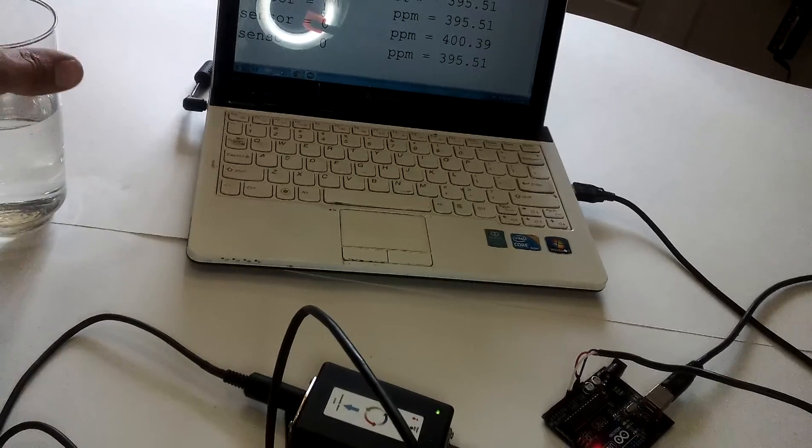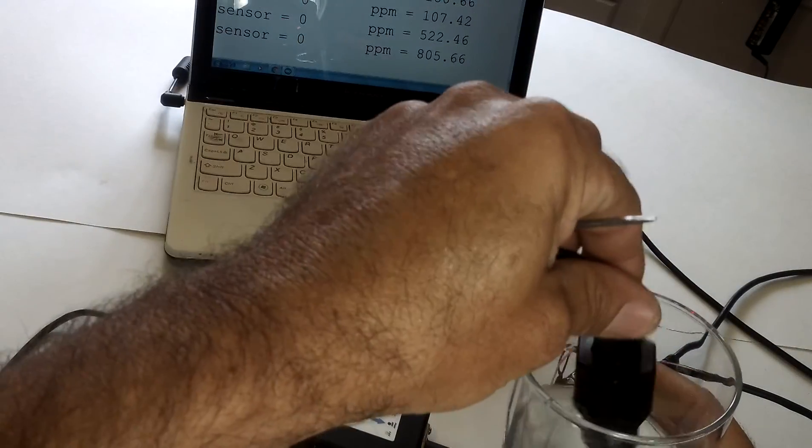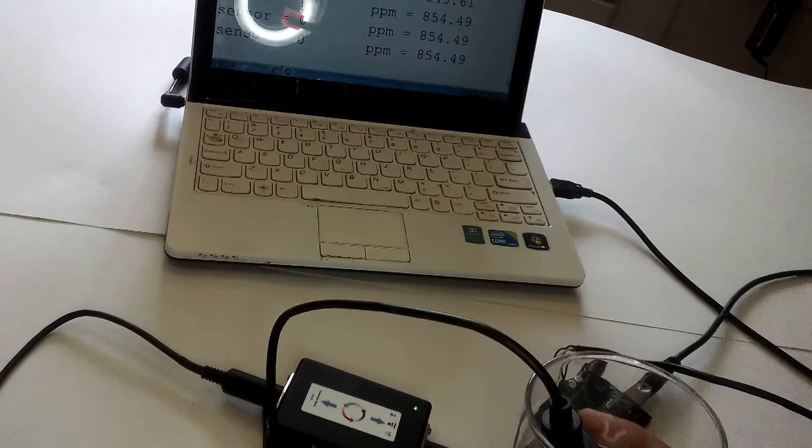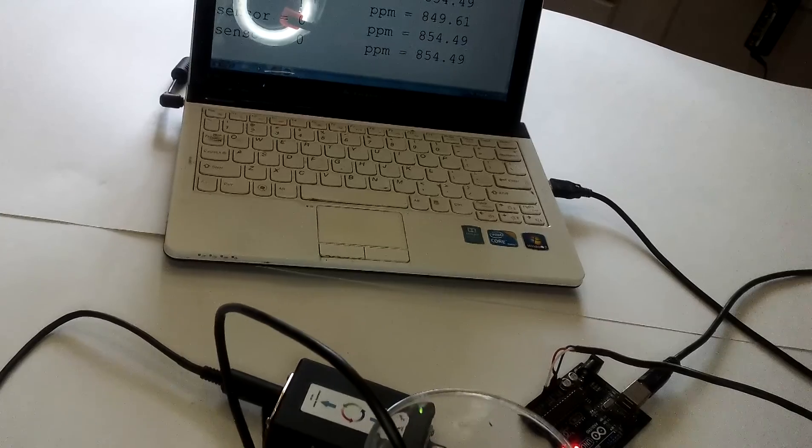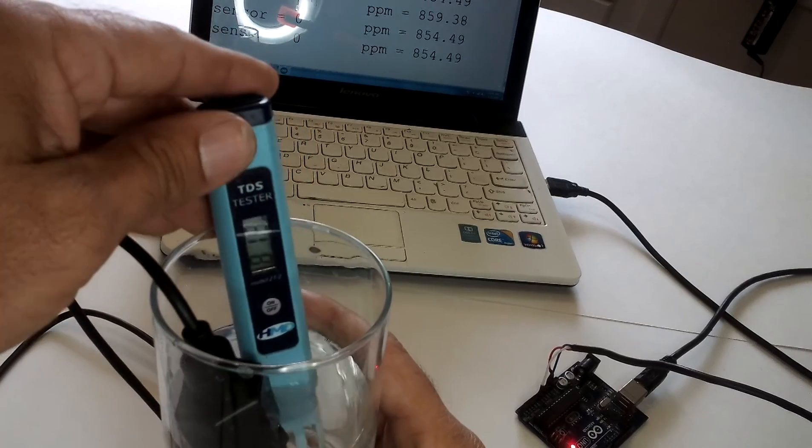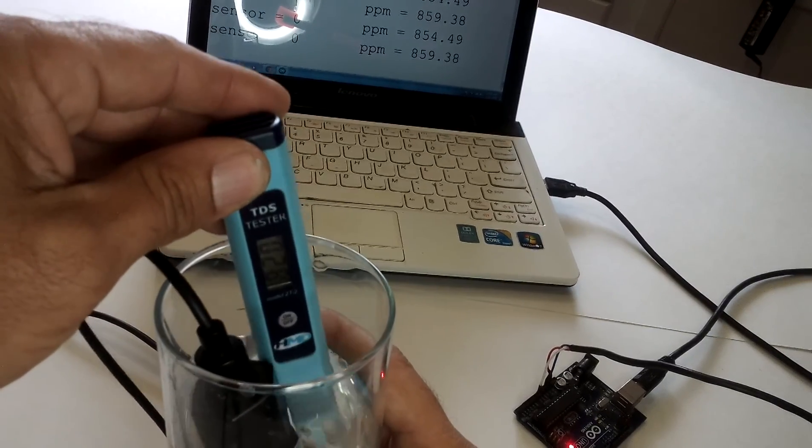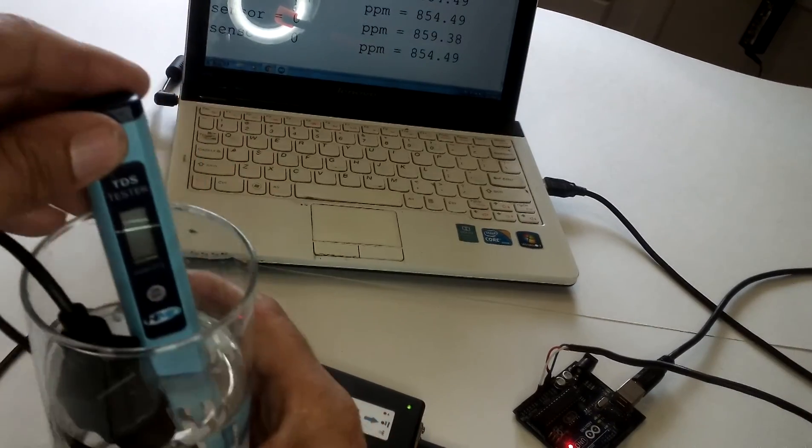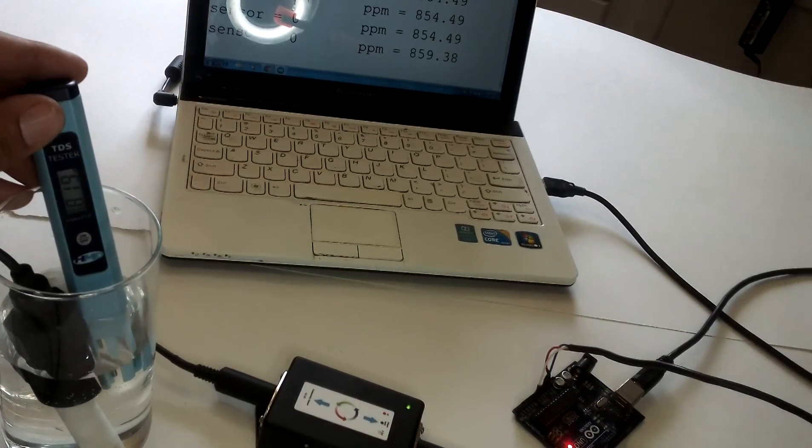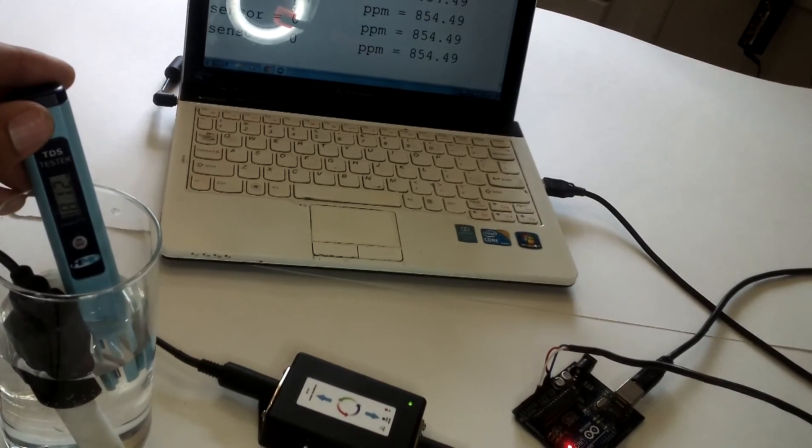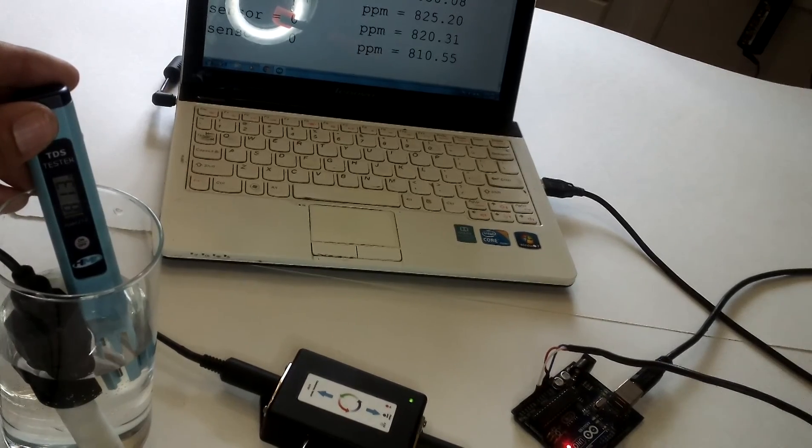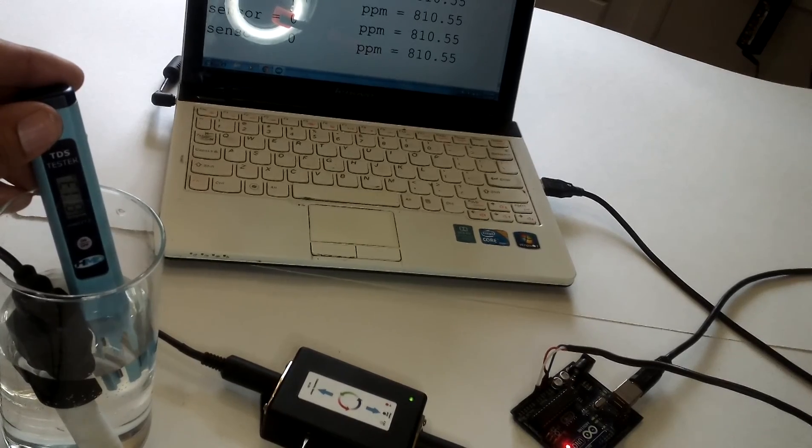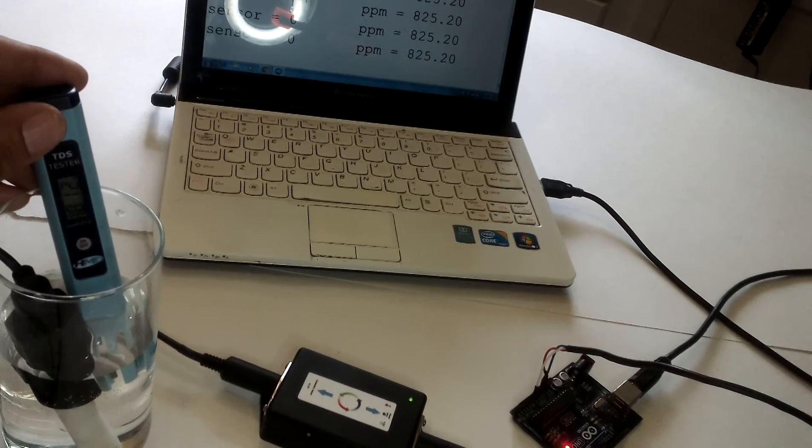And now let's put it in the known solution. And I'm reading about 854. Let's see if it's accurate. I'm getting about 820. So again, fine tuning, 820. So let's bring it down to 820. Oops. There. 820, 825.